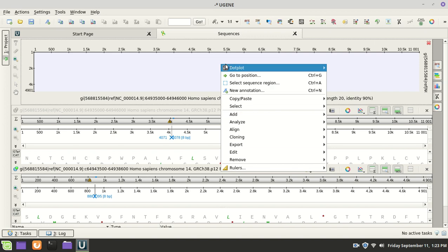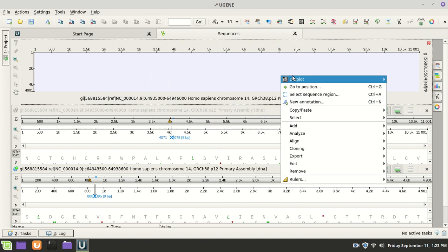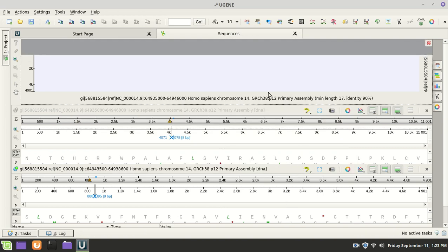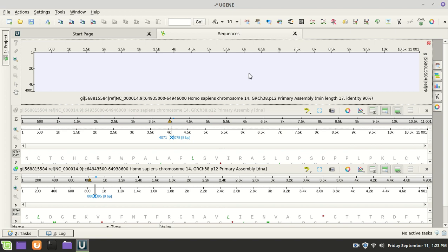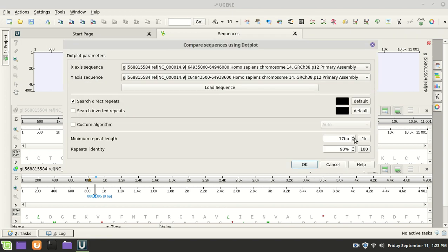Still nothing. Oops, hit the wrong one. Alright, let's go to 17. Still nothing. Alright. But we know when we get too low, it's too messy.